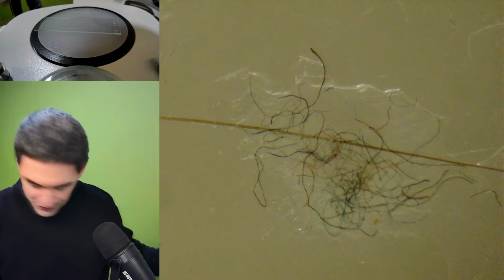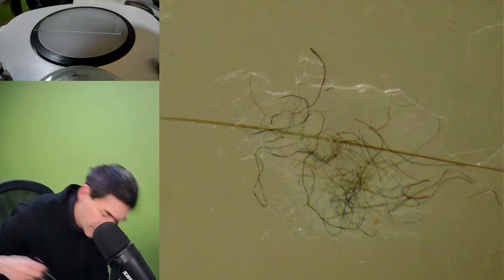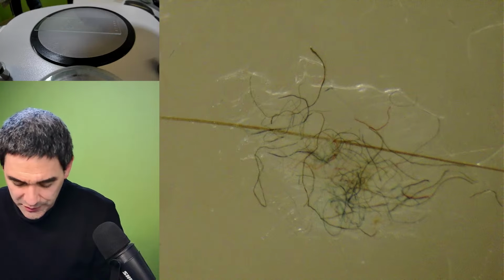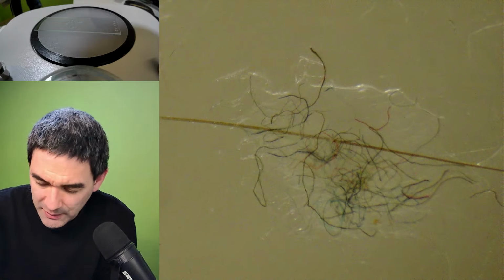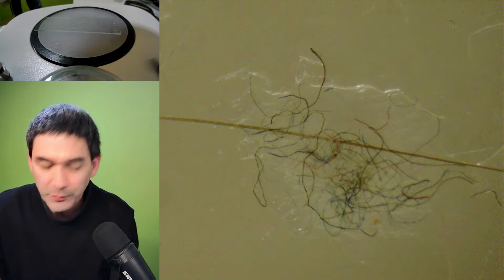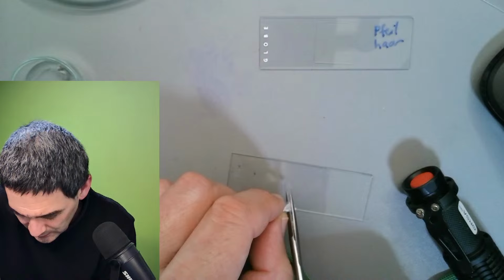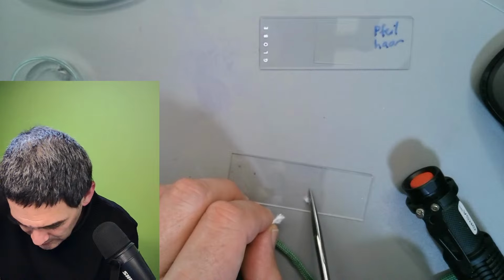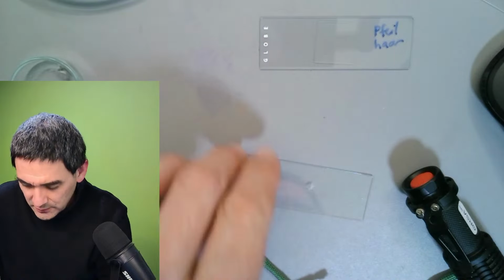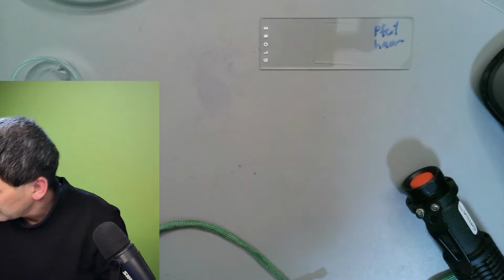Now I also got a little bit curious. Okay, I'm going to try those here now. Those synthetic fibers from the cord, from this one over here, if they are fluorescing, I don't know. I dropped it.